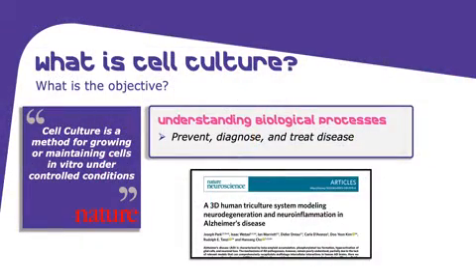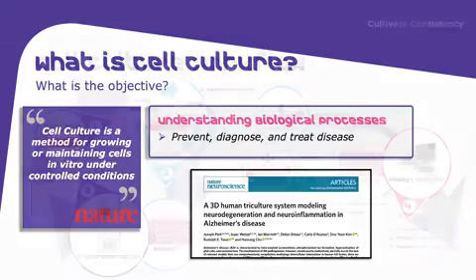So what is cell culture and what is the objective? Basically, cell cultures are cells grown outside of their natural environment under controlled conditions. We all know that cell culture is absolutely essential in research. It has helped us to understand complex cellular physiology, how cells function and respond to stimuli, and to understand biological processes in order to prevent, diagnose, and treat diseases.